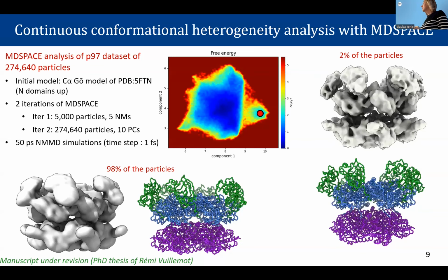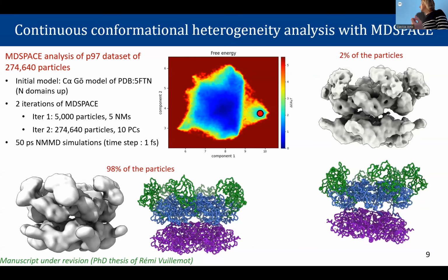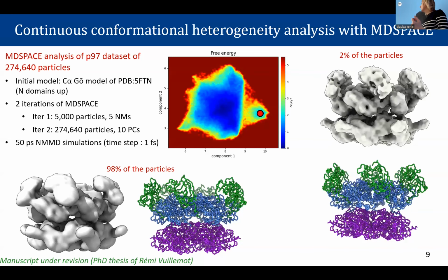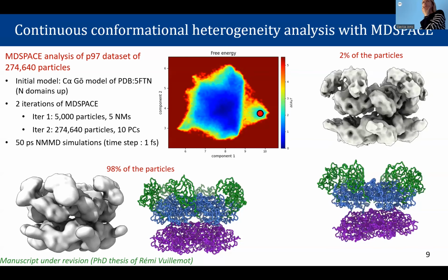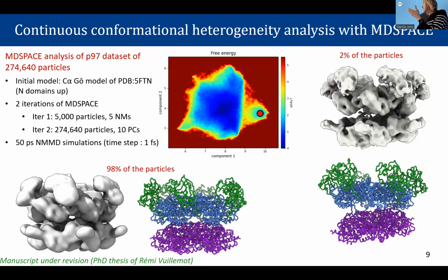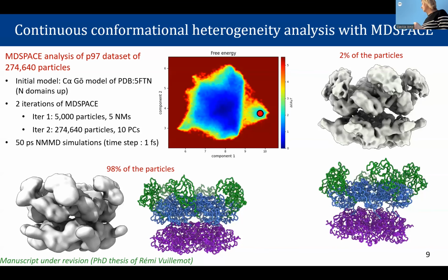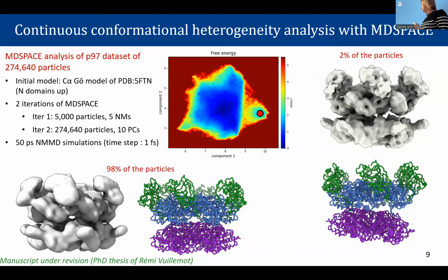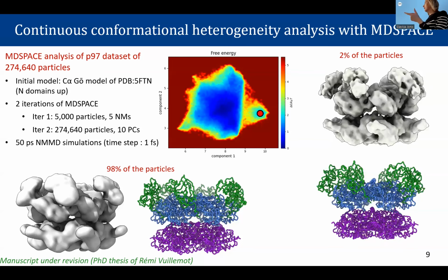So this is a reconstruction from a number of images, a 3D reconstruction. So you see that this is density. What you see here is an isosurface, but basically it's a volume, okay, with voxels inside. And what you see right here is just one isosurface.